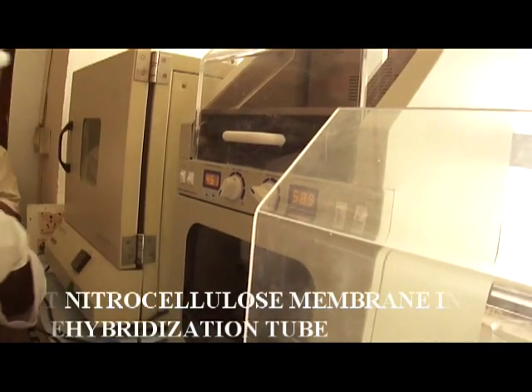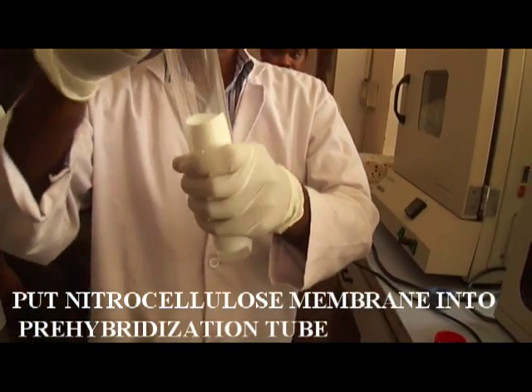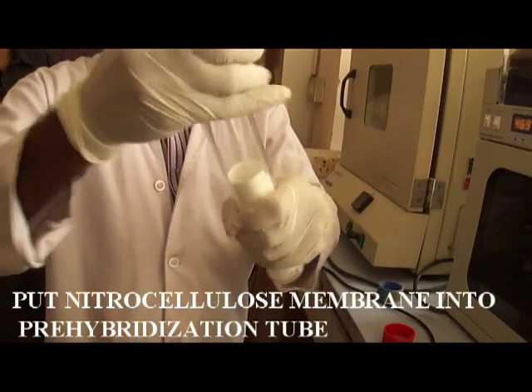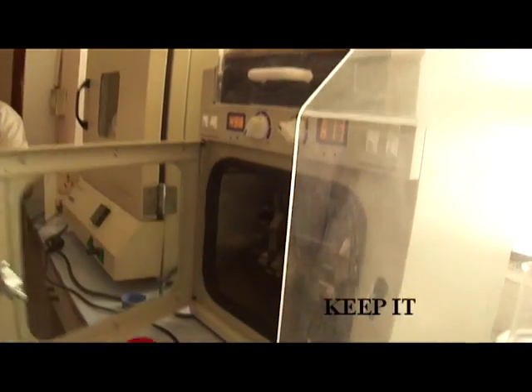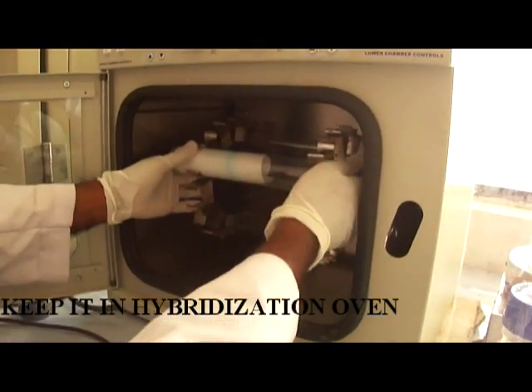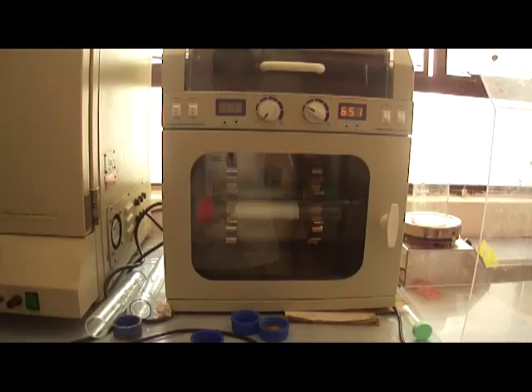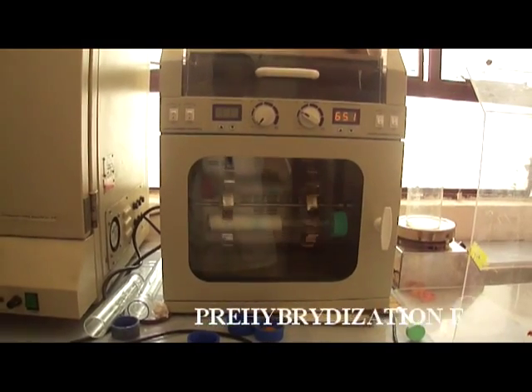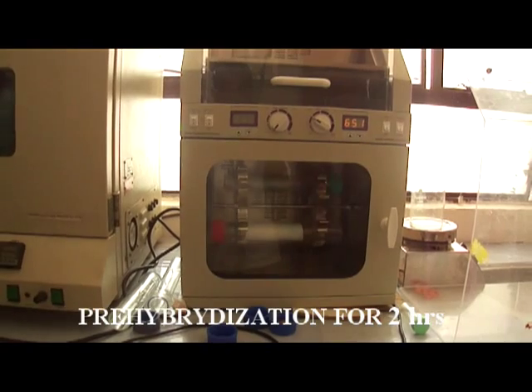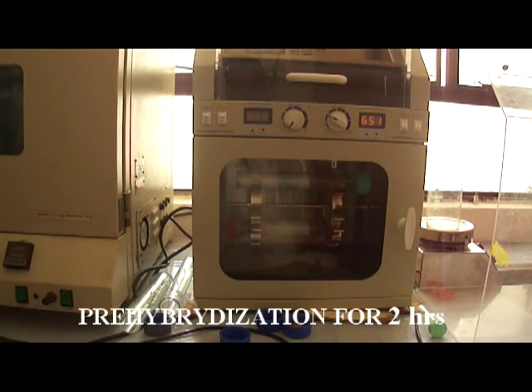Then for pre-hybridization, place the membrane into the hybridization tube in such a way that the DNA side is facing inside the tube. Add 40 to 50 ml of Church buffer into the tube, then keep these tubes into the hybridization oven for pre-hybridization. Keep this pre-hybridization process for two hours at 65 degrees Celsius temperature.